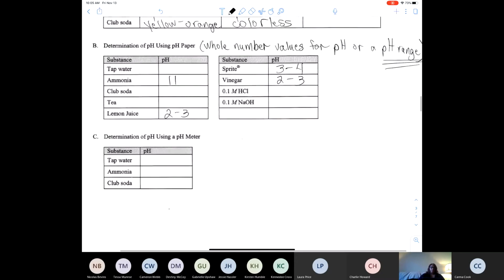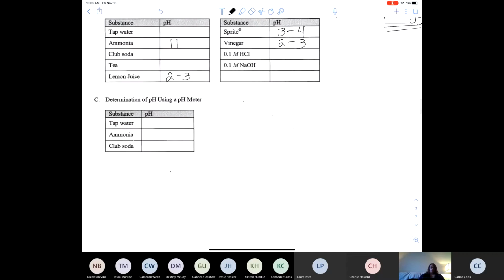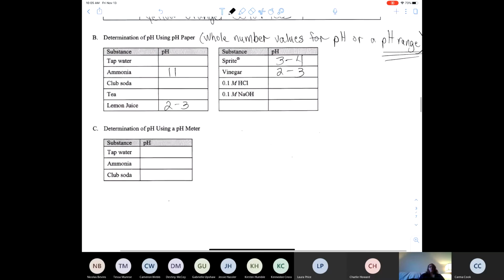And so, of course, the pH meter part was straightforward. You just simply read the readings that were shown on the computer screen. The pH probe or pH meter that I used, if you could see in the pictures, I had it connected to this little white box called a Vernier Lab Pro interface device. And then I had another cord connected to a specific channel in that device that I plugged into the USB port of my computer.